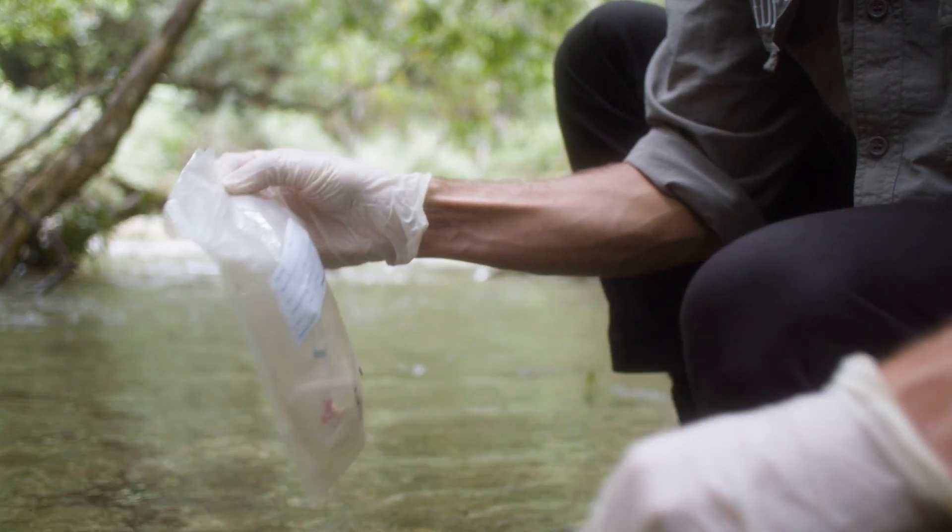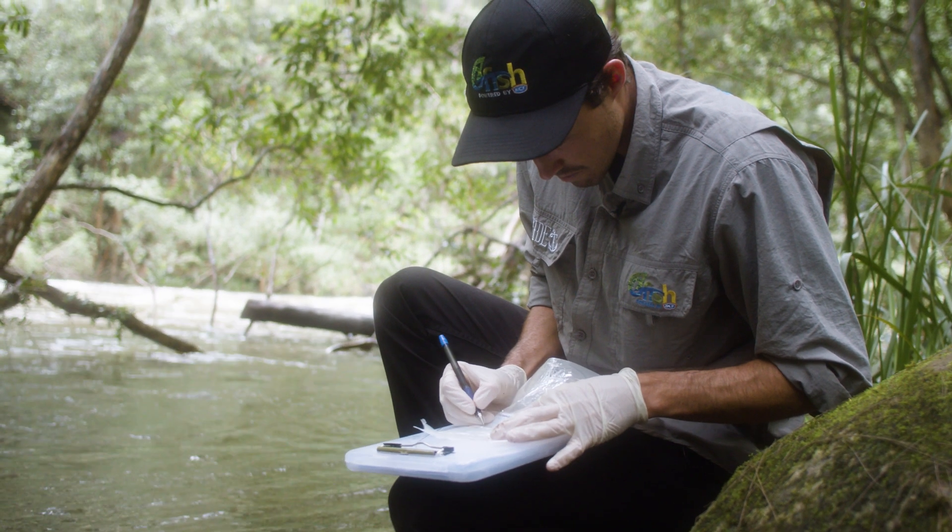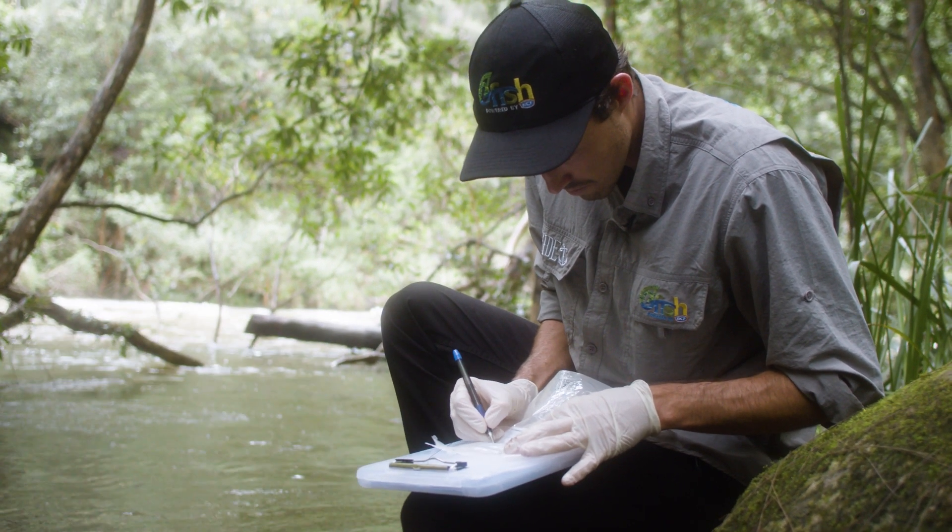All we need to do now is fill in all the details: who did this sample, which waterway we're at, what the latitude and longitude were, as well as the total volume filtered.